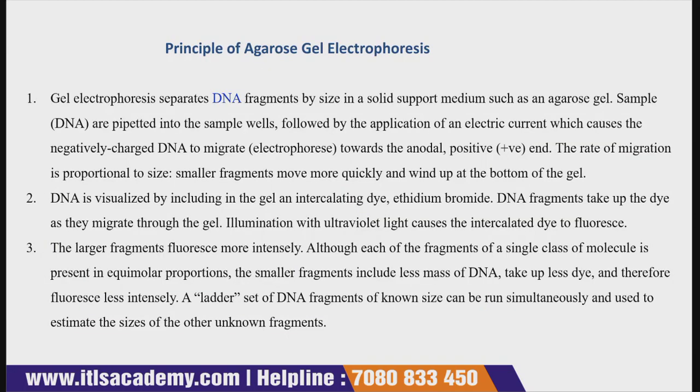Now, what is the principle behind agarose gel electrophoresis? Gel electrophoresis separates DNA fragments by size in a solid support medium such as agarose gel.